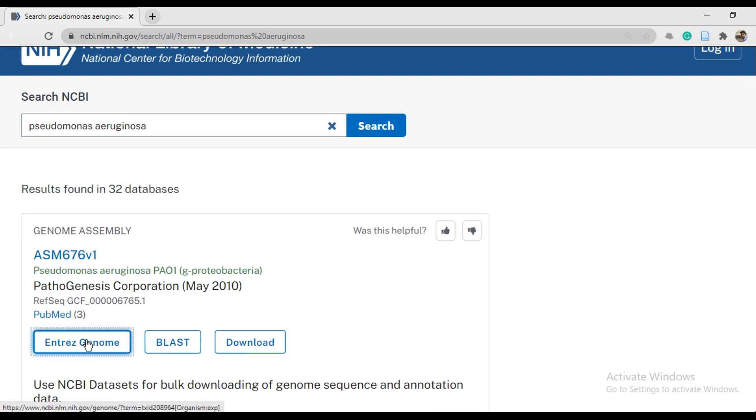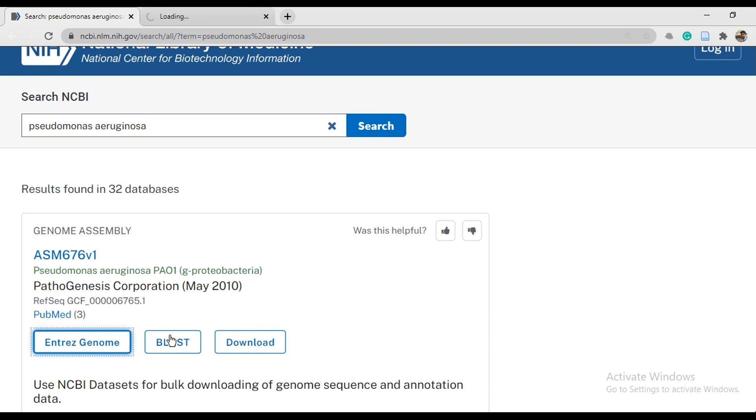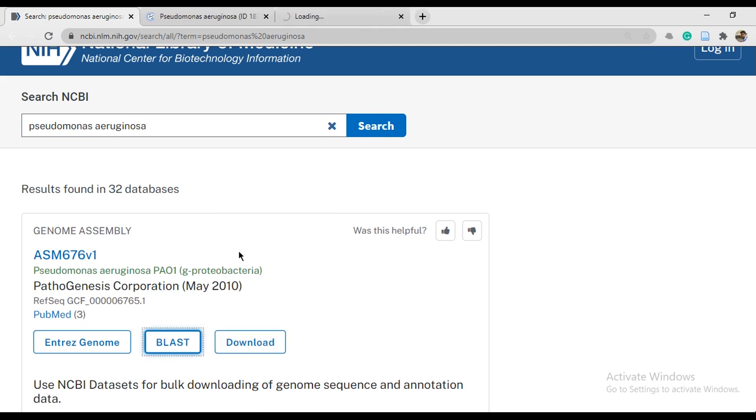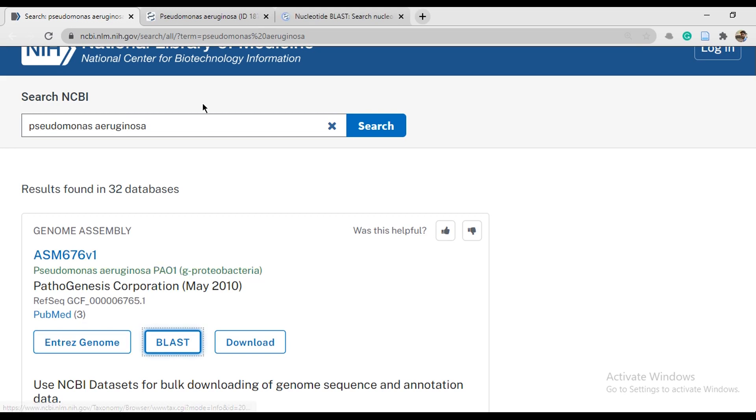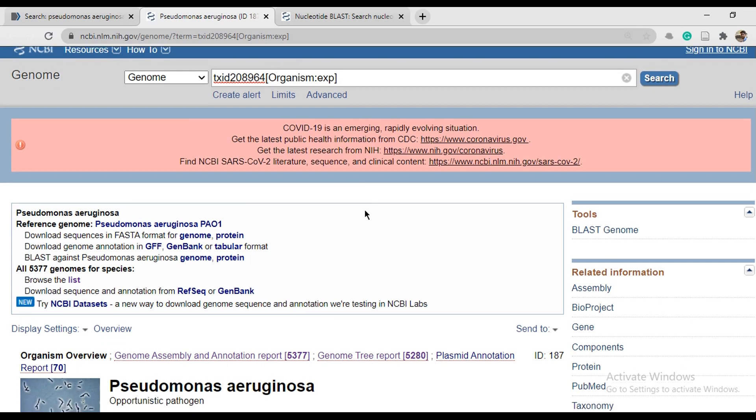First one is Entrez Genome, so open link in new tab. Second one is BLAST, so open link in new tab. Then it's Download. Let's go with Entrez Genome.